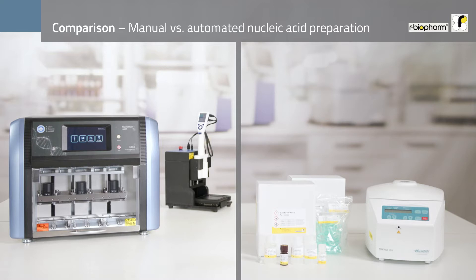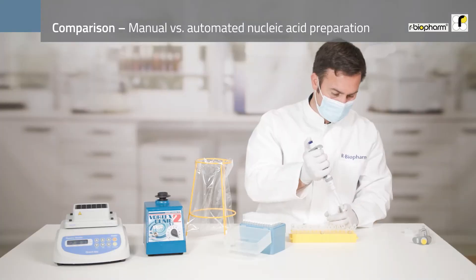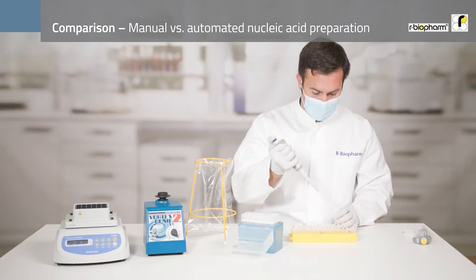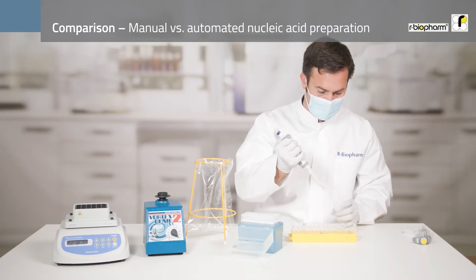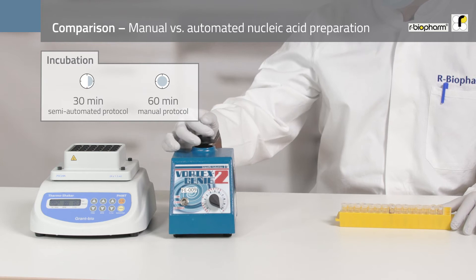What is more convenient — manual or automated nucleic acid preparation? Let's take a look. Imagine you start with the usual lysis procedure. When analyzing plant or animal DNA samples, you add all necessary lysis reagents and incubate the samples after mixing them.